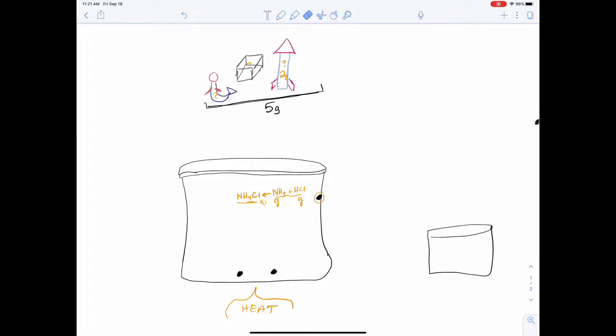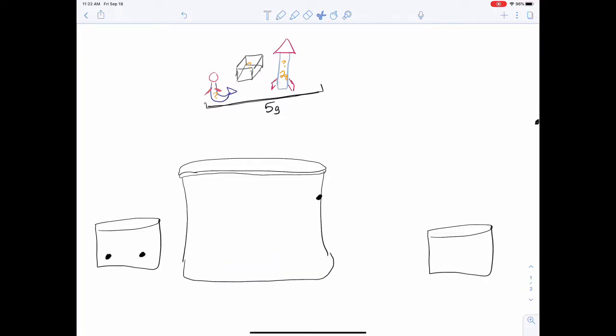This is not a problem at all because it's stuck very, very firmly and we can pour the mixture out around it. So what has just happened is that our rocket has left the beaker, or there's a tiny bit of rocket stuck on the upper section of the beaker. Now we have 2 remaining things. We still need to separate them, but we have to get them to cool first. Let's move the remaining compounds into another beaker that's cooler. We'll let the whole thing cool and we'll get the mass.